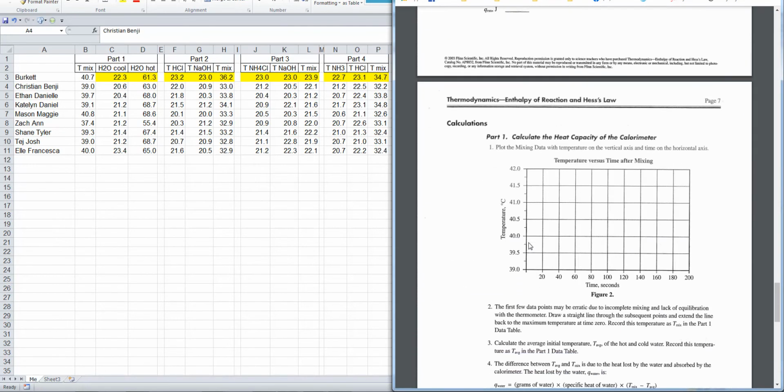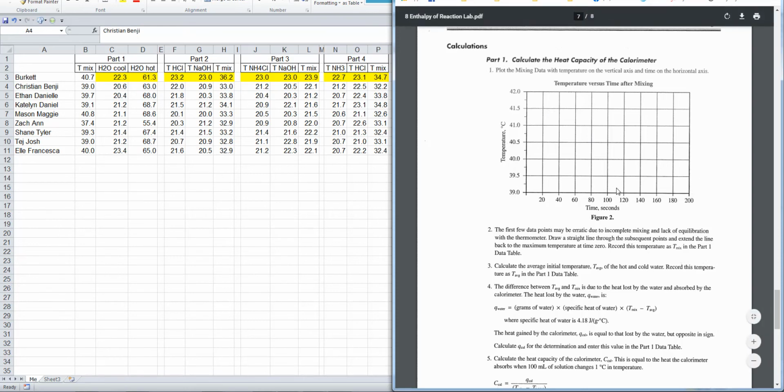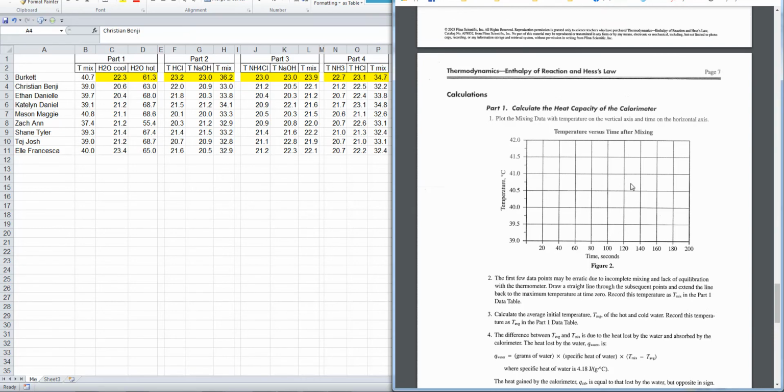Whenever we get down here, notice it asks you to use this graph. In the video when I pointed out a line of best fit, that's essentially what this graph is asking you to do. It's not really linear here. It drops off a little bit. So you can read what number two is, but all this is doing is calculating this T-mix, which I've already given you. So everybody has a T-mix for part one.